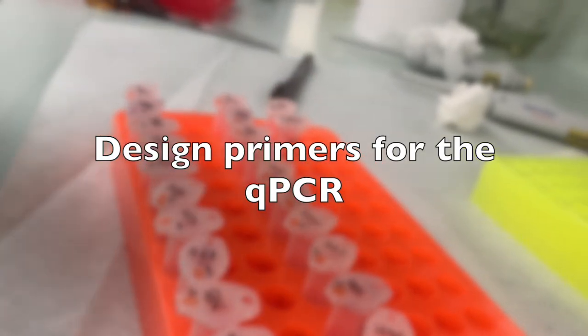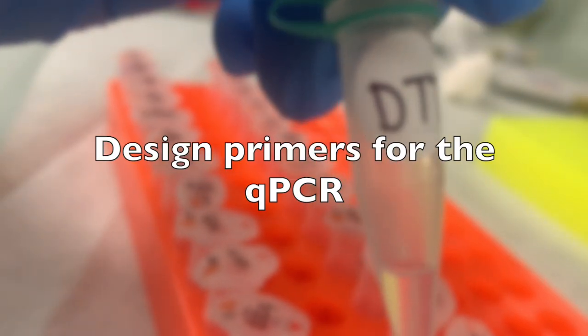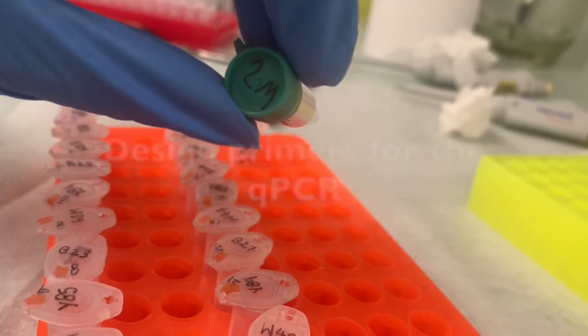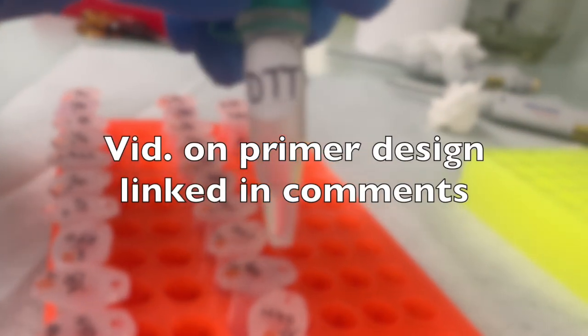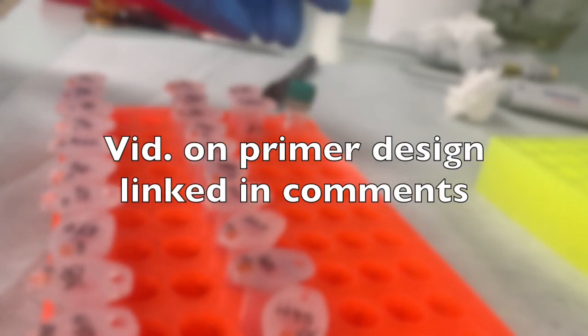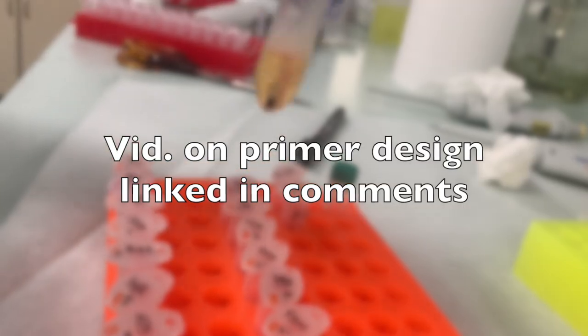Once you have the cDNA, before you can do the qPCR, you need to design primers. I have a video on here that will help you if you've never had to design primers to get an idea of what that process looks like. Would that be useful to you? You can check it out.